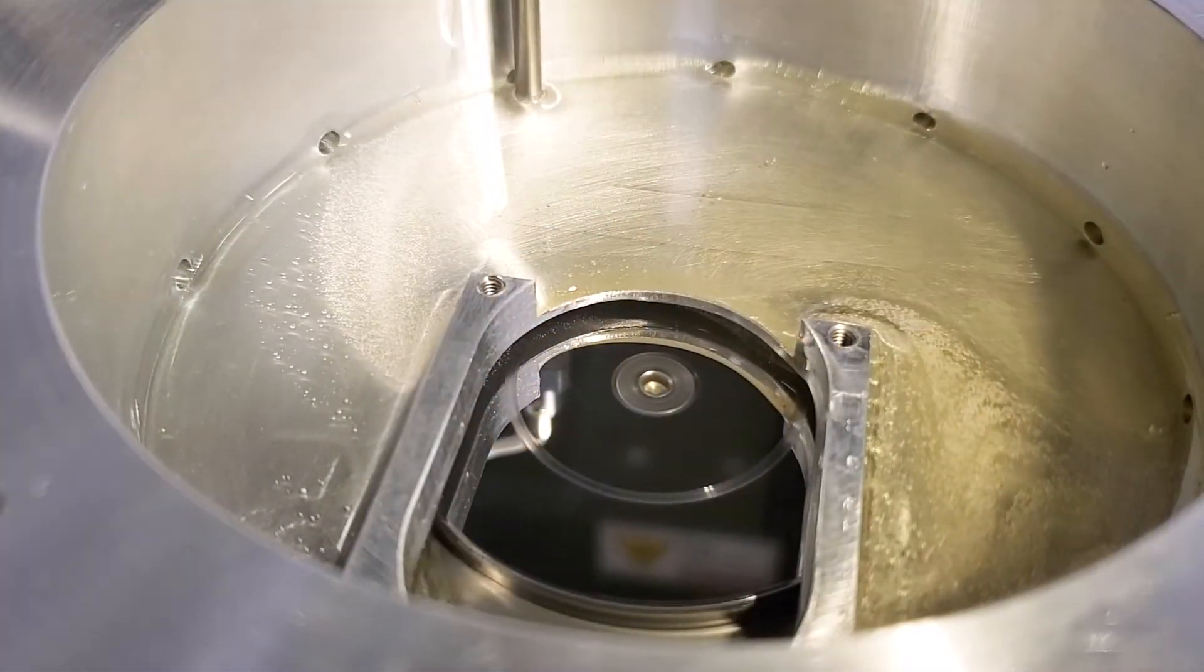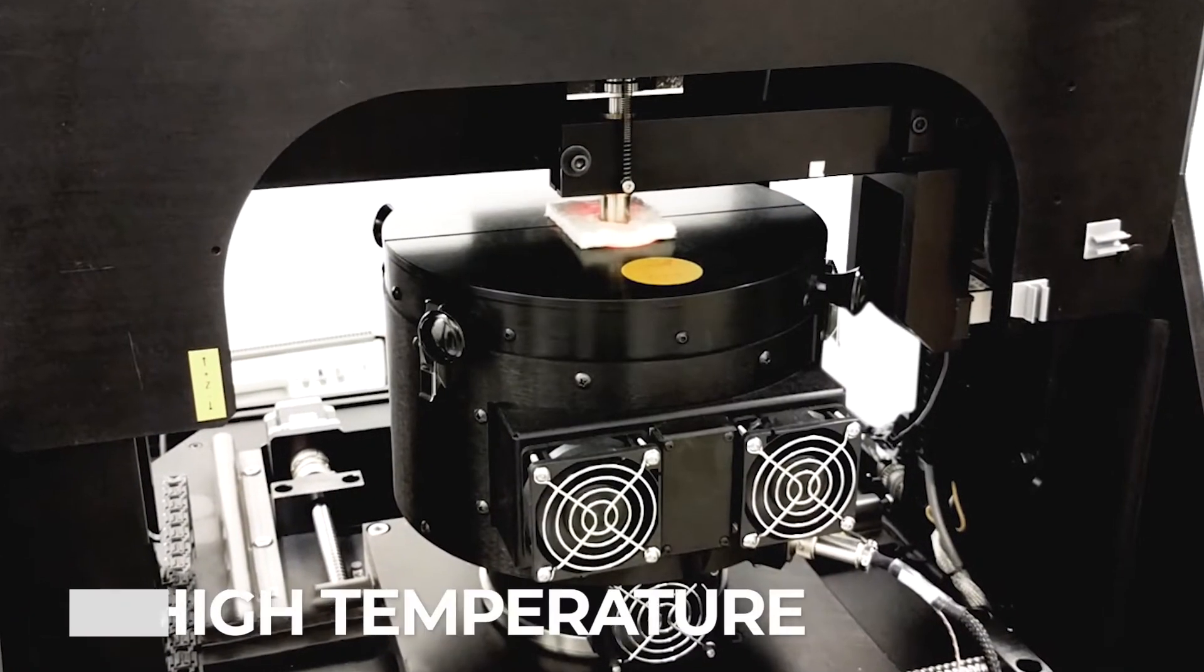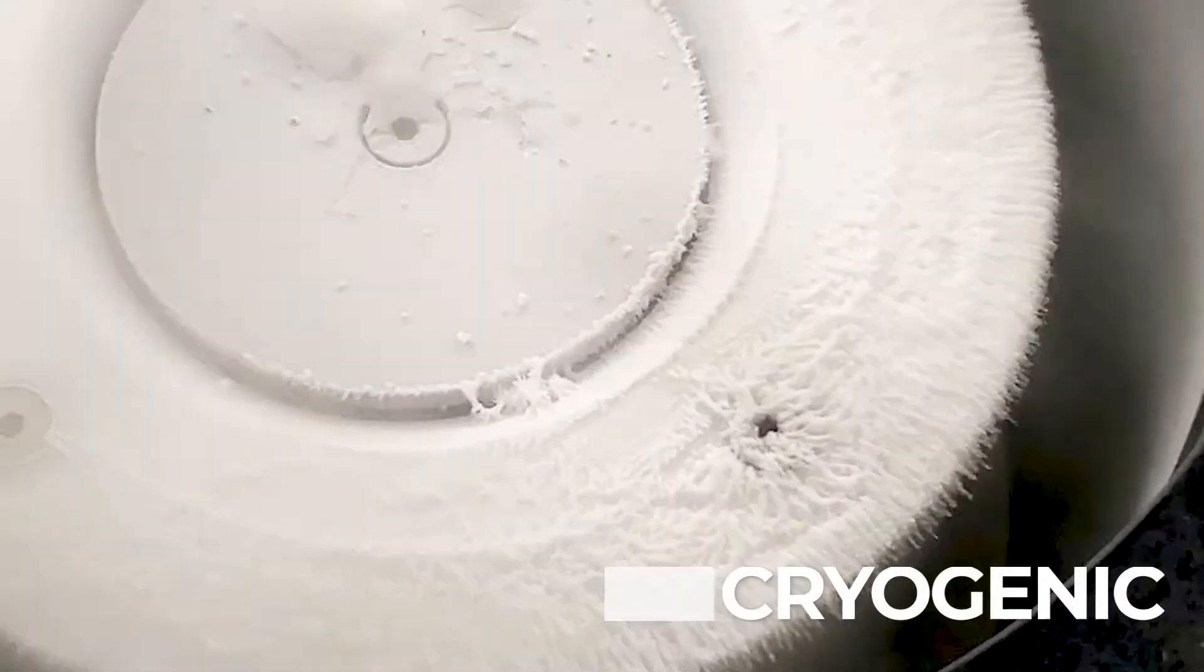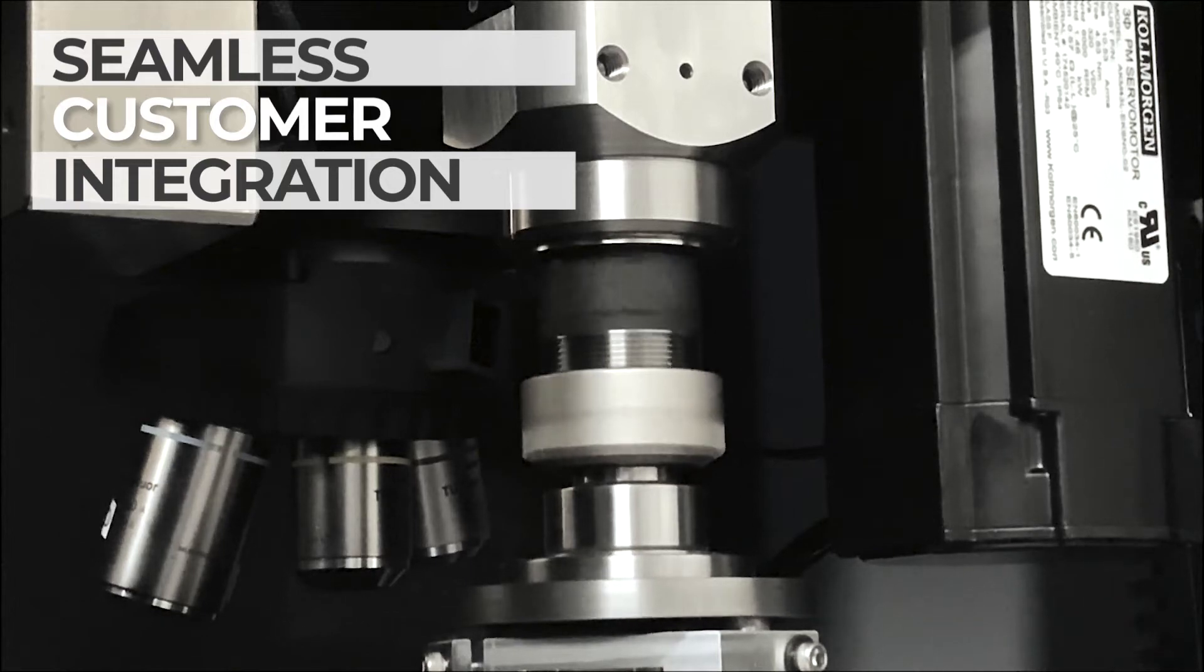we give real-life simulations of a multitude of controlled settings, such as vacuum, high temperature, and cryogenic, while simultaneously and seamlessly integrating into our customers' working environment.